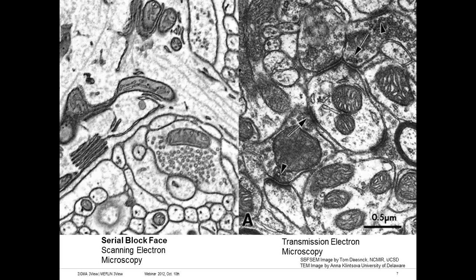If we look at a serial blockface image, again, this image was taken in an SEM, but it resembles very much what we're used to seeing when we collect an image with a TEM.